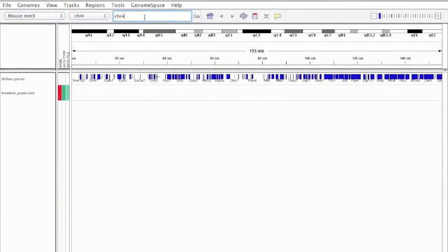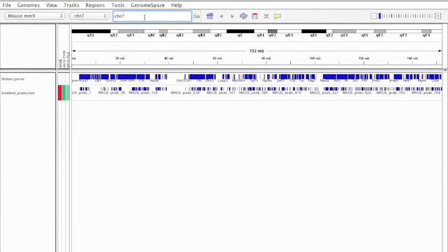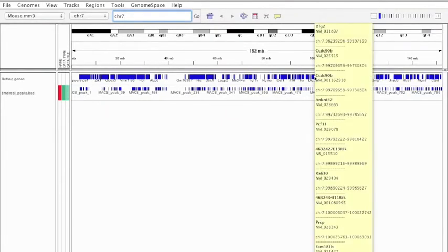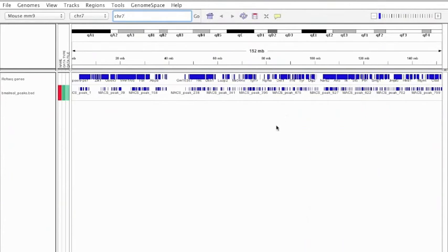Once again you can't see the peaks because we only mapped chromosome 7 in this case. When we change it to that, you can see the annotation, which will give you the score and the chromosome position, and also the gene loci. There are a lot of features to explore, but since this is a basic introduction, we'll stop here.